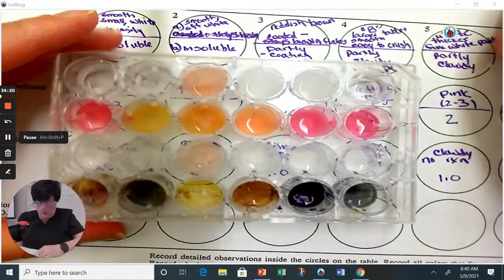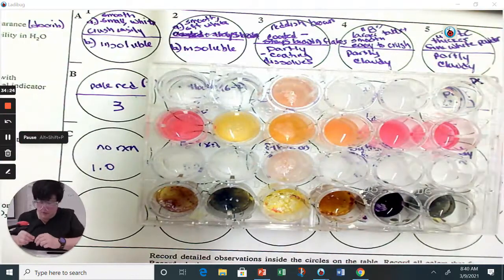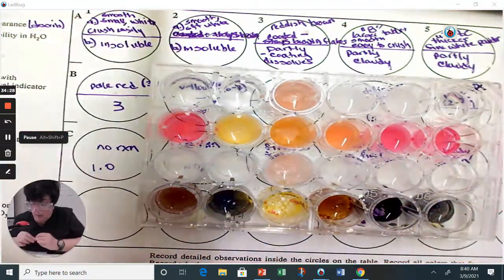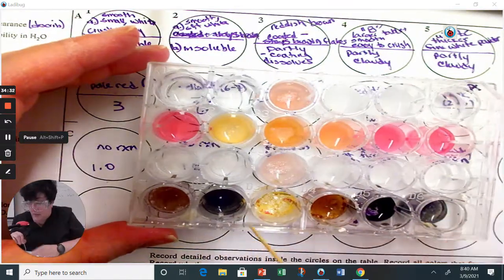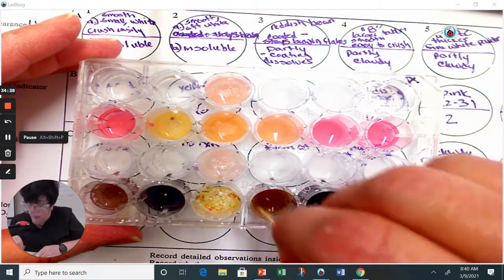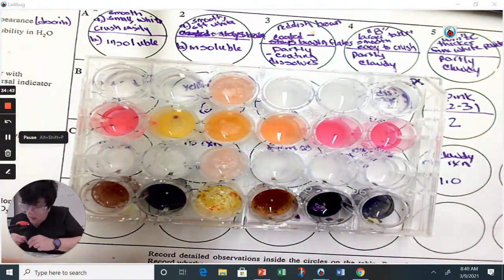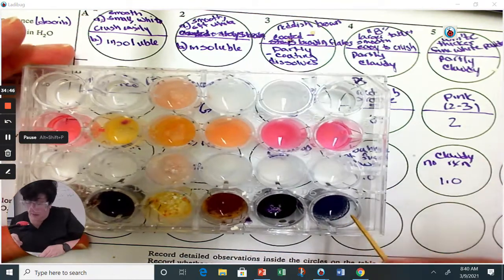Okay, so the material turns purple like the clumpy material, and we get a fresh one. So that's a light purple. That's a grayish purple. That's yellow. This turns brown. A little bit purple, but mostly brown. Let me get another one. This is very purple. Like deep purple. And this is a light purple.